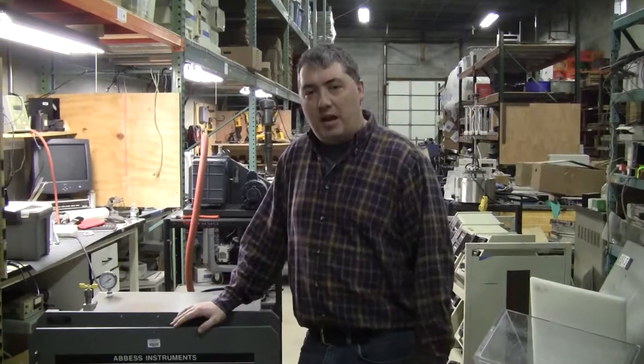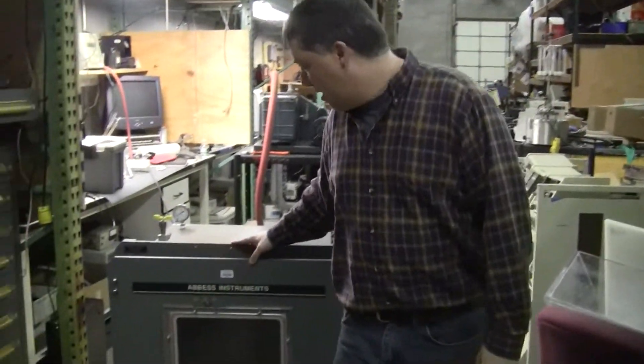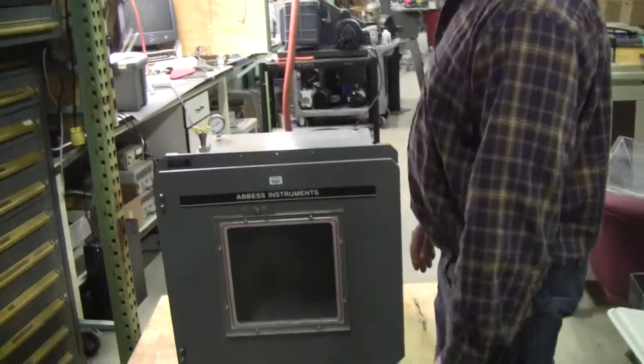Hi, this is Michael Nakedow from Hitech Trader. Today we're looking at an Abbess Instruments Vacuum Degasser.